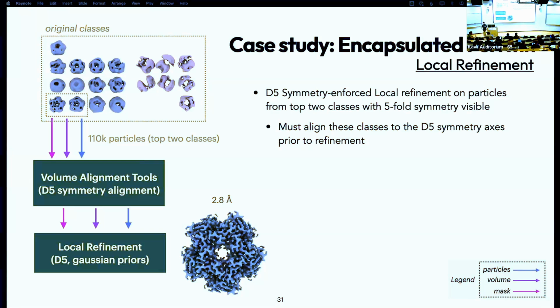So my question kind of follows up with the question beforehand about amino acids and resolvability. If you have a knock-on effect that changes a whole bunch of atoms, you can distinguish that really easily. What do you think about the development of laser phase plates? Because really we're talking about a signal to noise ratio problem, right? So you add a laser phase plate, how does that change the equation?